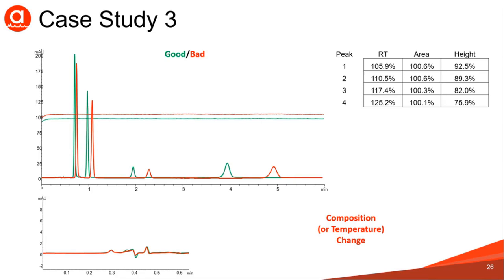In this case, it is in fact composition. You'll find that changes in composition cause significantly larger changes than the changes in temperature.